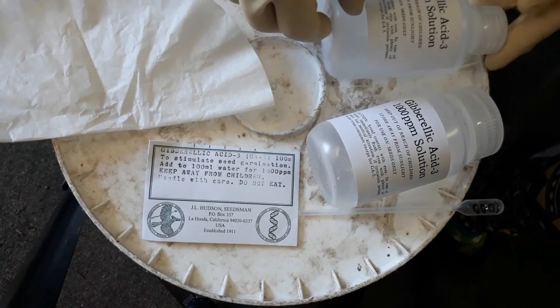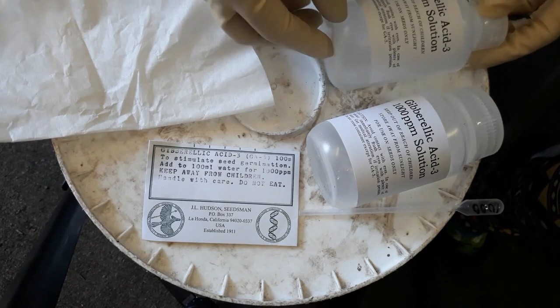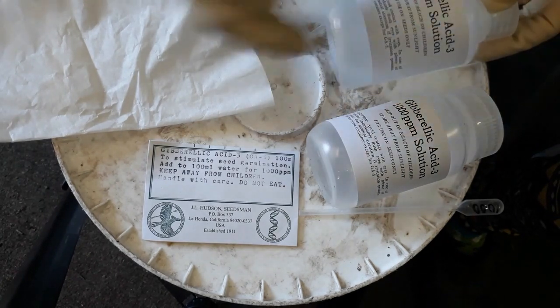Sometimes gibberellic acid is used to stimulate elongation of internodes on things like grapes so that you don't get molding on there. We're using it here for seed germination.